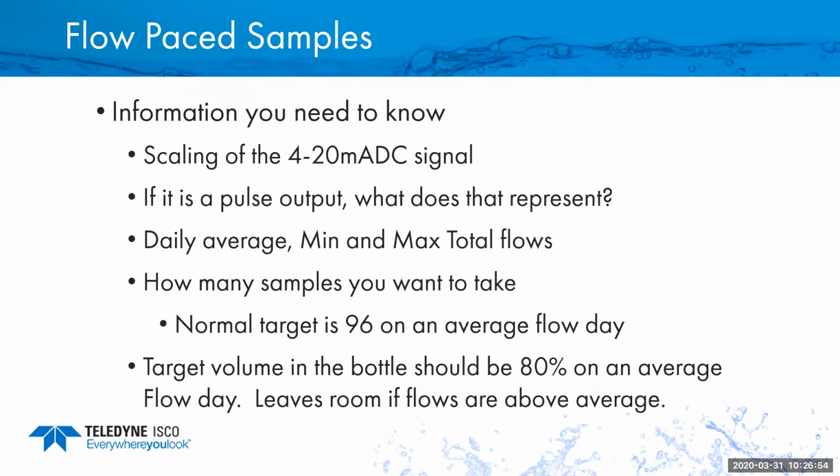When you're figuring out how much volume you actually want to have, your target volume in the bottle, we'd like to get it about 80% full. So on an average day, you're going to see 80% of that bottle full. You're still going to have 20% to work with on a high flow day, so you can actually get a little bit more sample on a high day. If you got a really low flow day, then you're probably going to get a little bit less than that 80%. So basically, it just gives you a little window, plus or minus, so you don't overfill, or at least you always have enough sample.